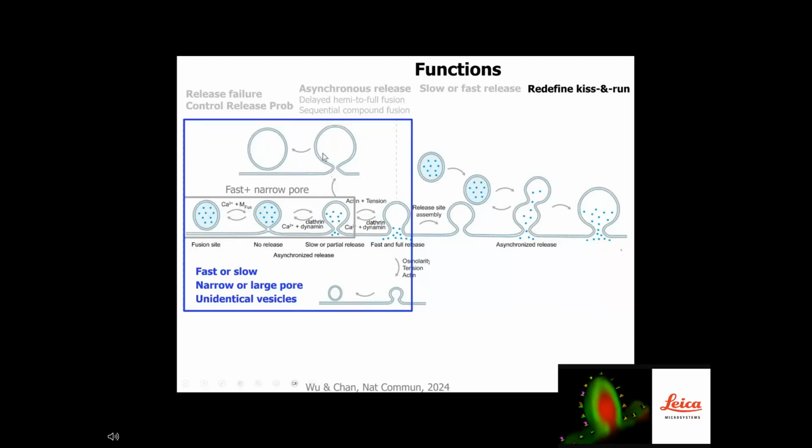So large vesicle fusion can close their pore to form large vesicles. The shrink fusion can be stopped here and close the pore, partially shrink, and then close the pore to generate smaller vesicles. So the kiss and run can control the vesicle size.